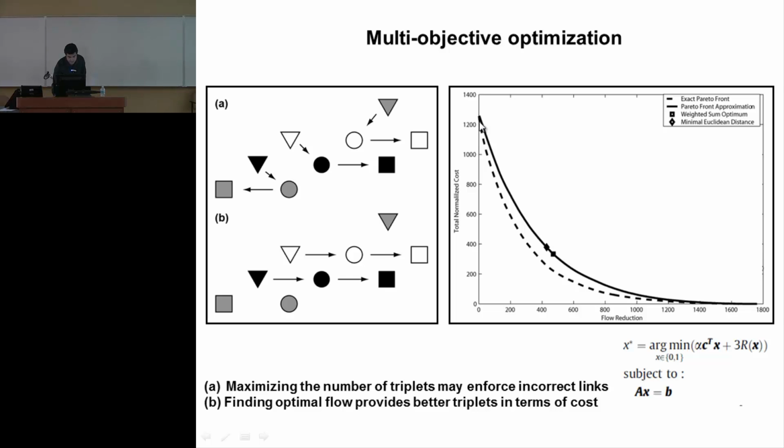And we have this maximum cost at no reduction, so the total cost at the maximum flow, then sacrificing some flow and having less total cost, and then we have completely. But the idea here is that we have this utopia point at 0, 0, which is the perfect solution. We don't sacrifice flow, and we have no cost of linking. This is not possible to happen. So in terms of solution, what I found was the closest point on the curve, which is the point here.